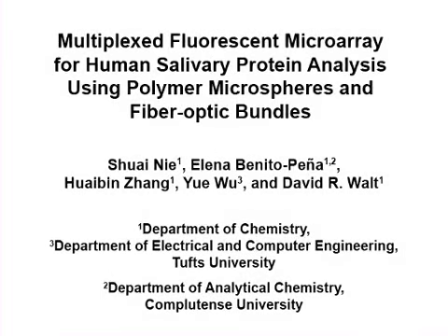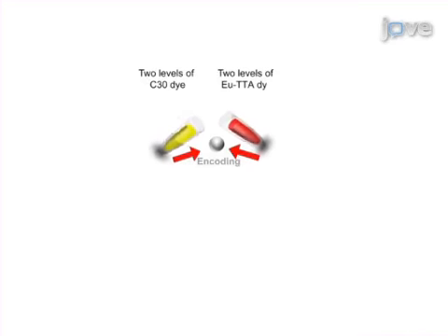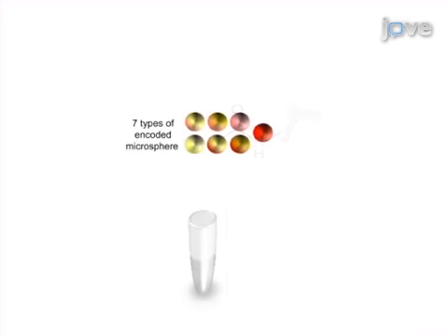The overall goal of this procedure is to analyze multiple proteins in human saliva samples using microsphere-based fluorescent arrays. First, encode the microspheres with different amounts of two fluorescent dyes. Couple the capture antibodies for different proteins onto the encoded microspheres.